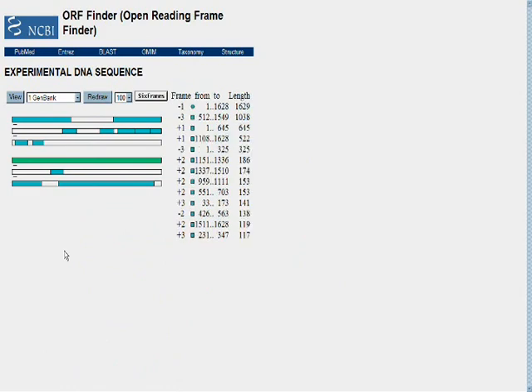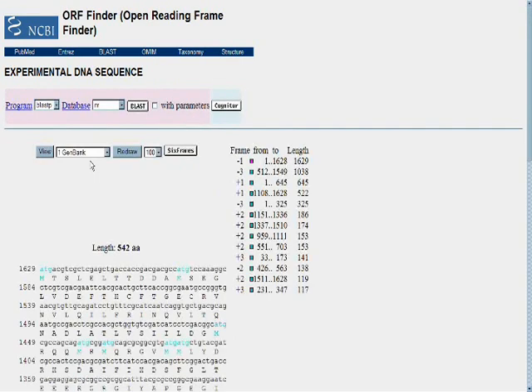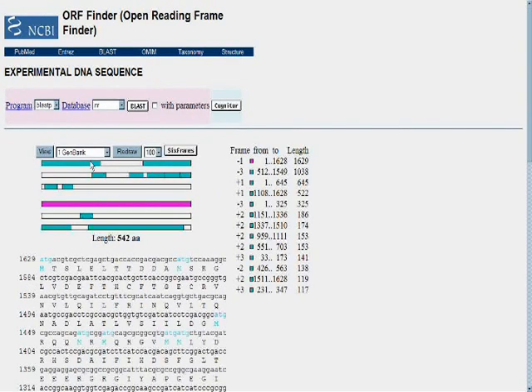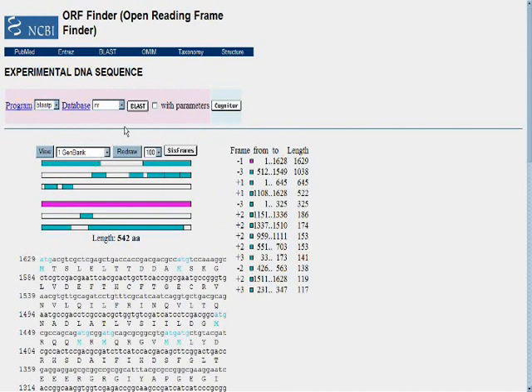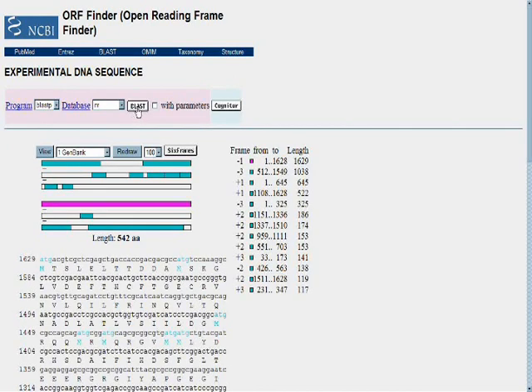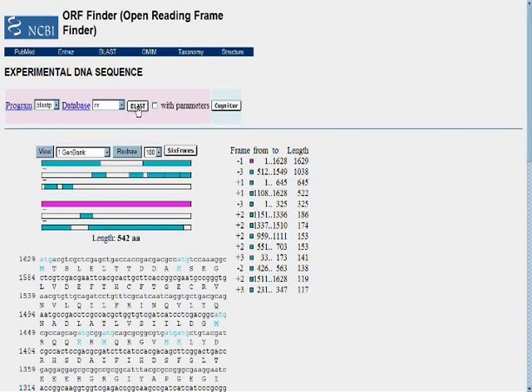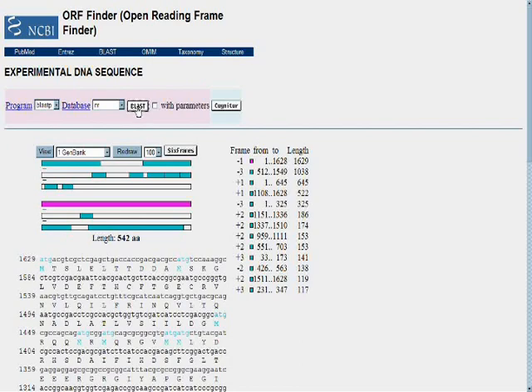We can hit accept, and that will tell the ORF Finder this is the candidate we want to analyze further. That renders the potential candidate sequence representation as green. We can go ahead again and select that by moving the cursor over and clicking. That results in the opportunity to go ahead and do further analysis.